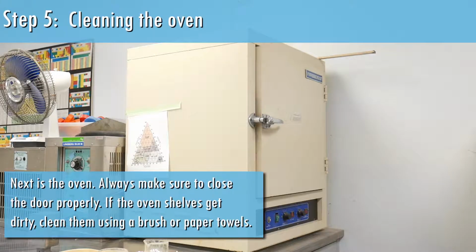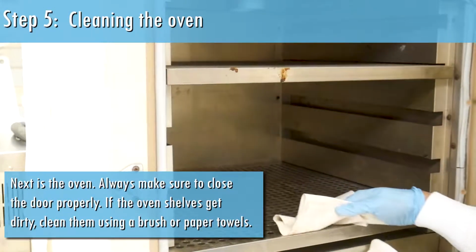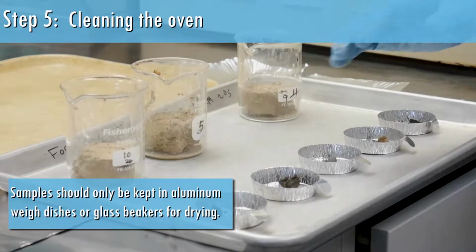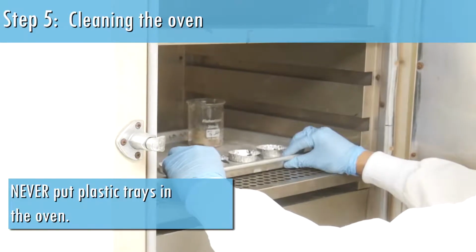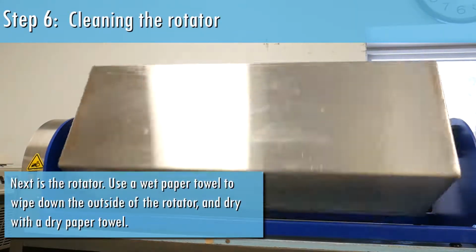Next is the oven. Always make sure to close the door properly. If the oven shelves get dirty, clean them using a brush or paper towels. Samples should only be kept in aluminum weigh dishes or glass beakers for drying. Never put plastic trays in the oven. Use tinfoil to wrap up any plant samples, as some plants make oily or sticky patches in the oven as they dry.